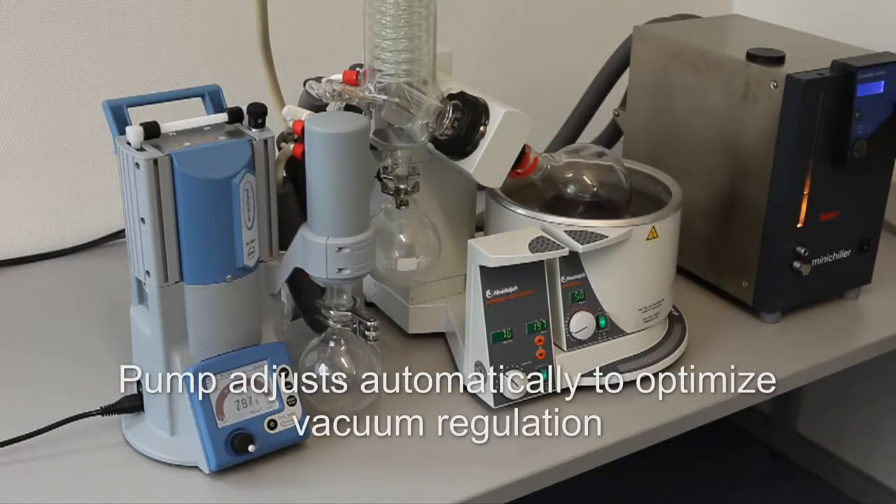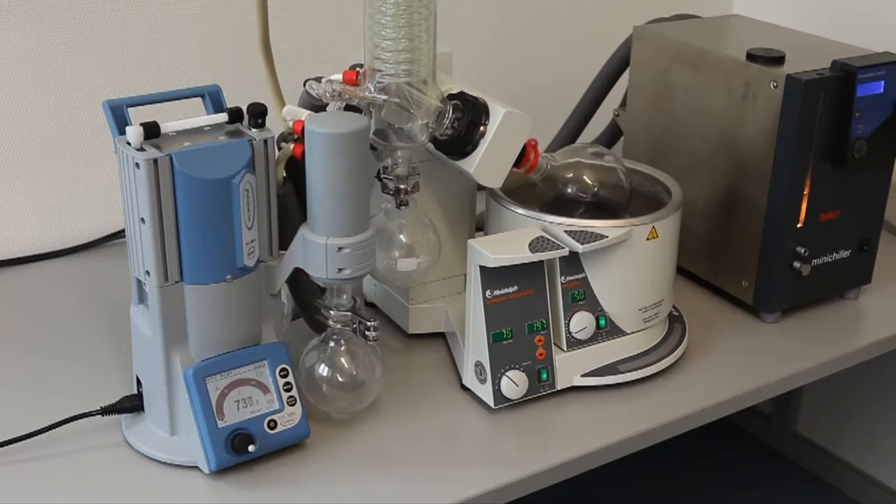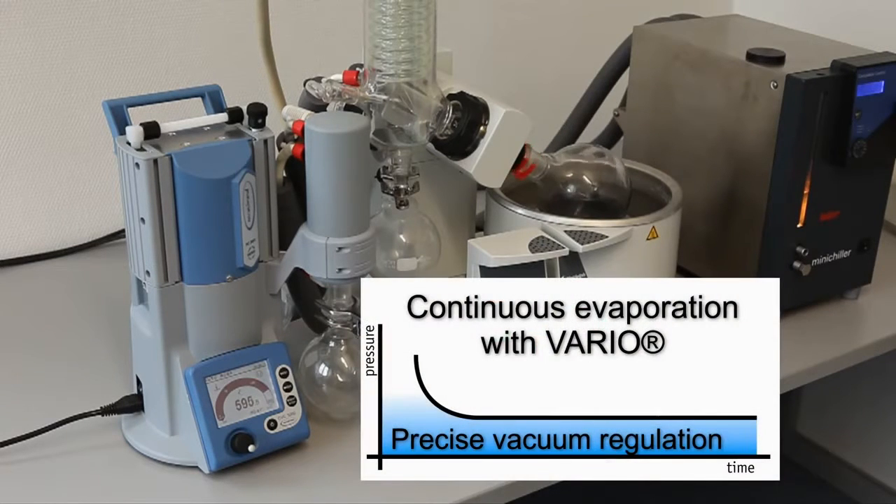The sensor technology of the PC-3001 Vario detects the boiling pressure automatically. The evaporation rate is intuitively adjusted by the vacuum unit through a variable speed motor.